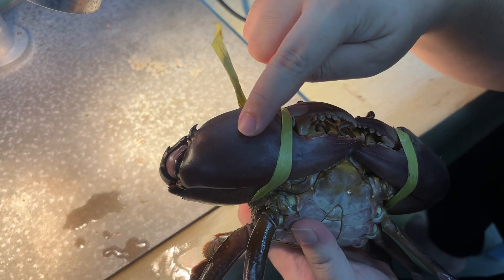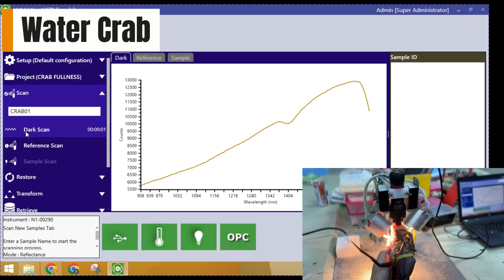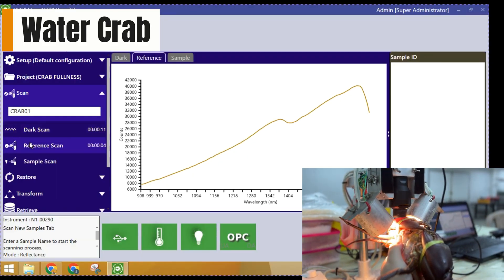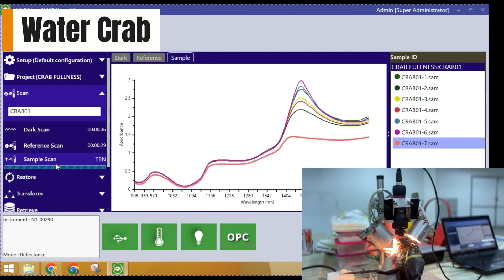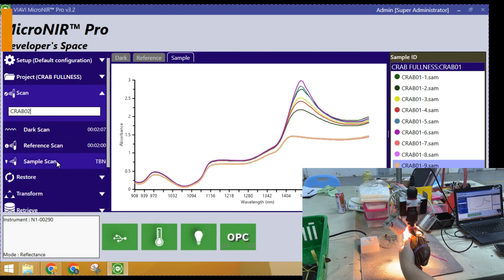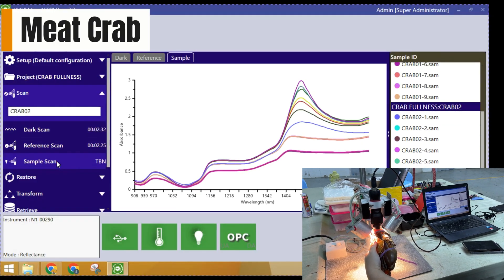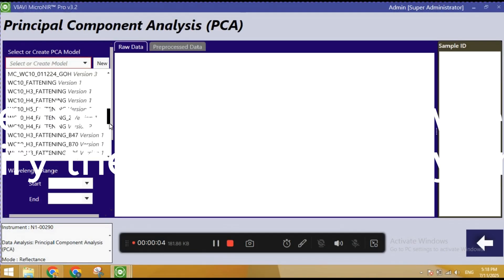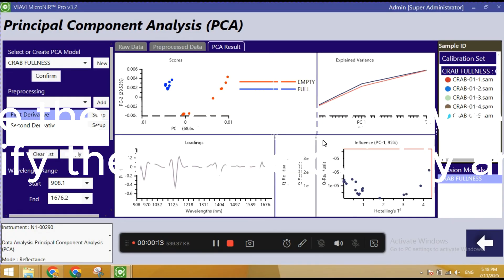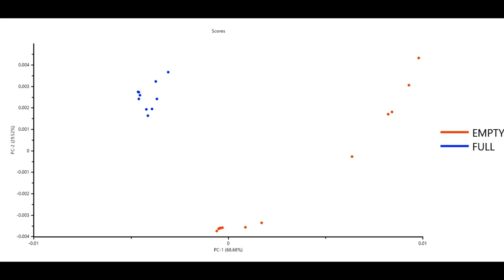We scan the crab's claw to get the reading. This is the result we get — you can see the difference between the water crab and the meat crab. This data helps us identify them more quickly and accurately next time.